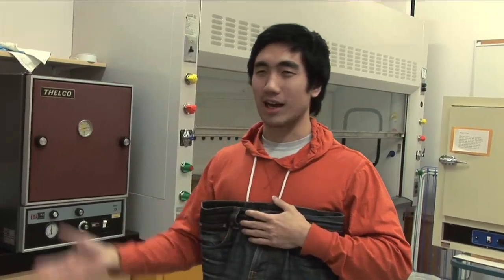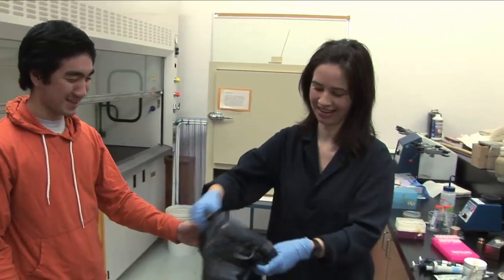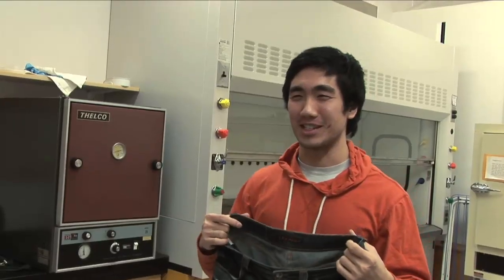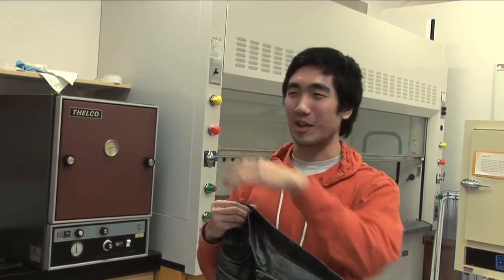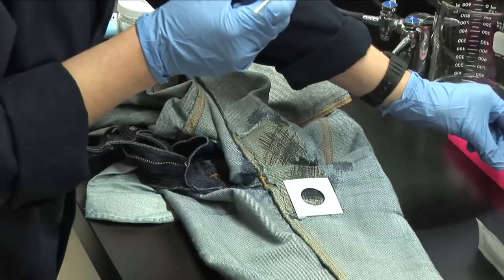The other part — with Dr. McQueen — we want to see what the bacteria count is and what sort of organisms are living on these jeans, and whether it's safe to have jeans unwashed for six months plus.